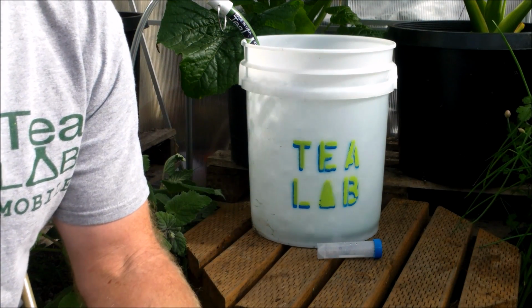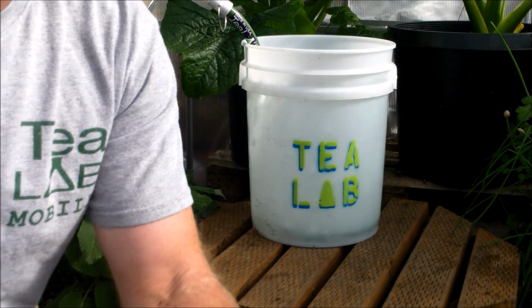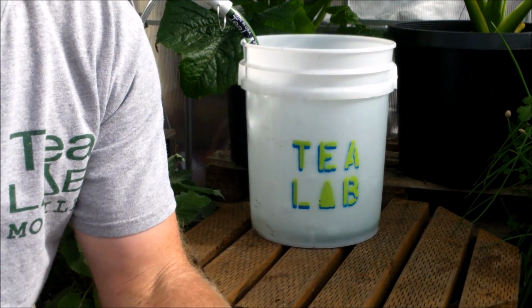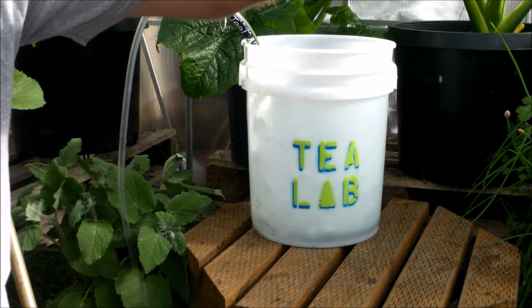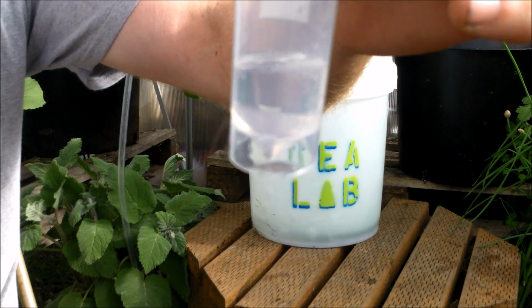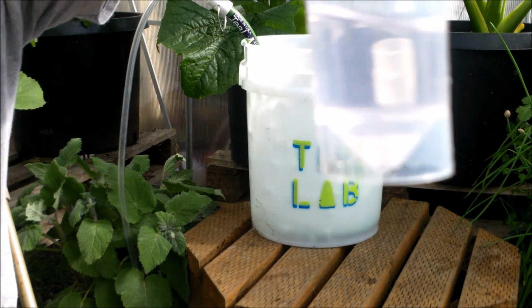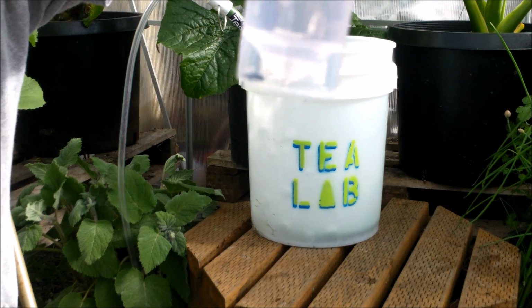Alright everybody, another hour has gone by. It's a little past 5:20. We're going to do a check again to see whether or not there is chlorine still in the water. It's been bubbling now for 4 hours. I put it in right around 1:20. Now it's 5:20. That's 4 hours, right? Let's give her a test. We want 10 mils. 4 hours of bubbling. There's a little bit of a pink color there, but there's a heck of a lot less. It's almost not pink, but it's a little bit pink. So we're going to do 1 more hour. All right, thanks guys.